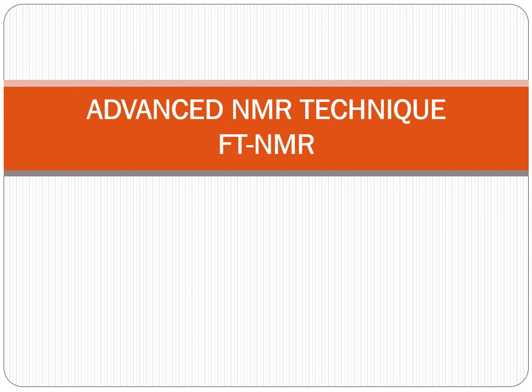Today I am going to explain to you about the advanced NMR technique, that is FT-NMR.